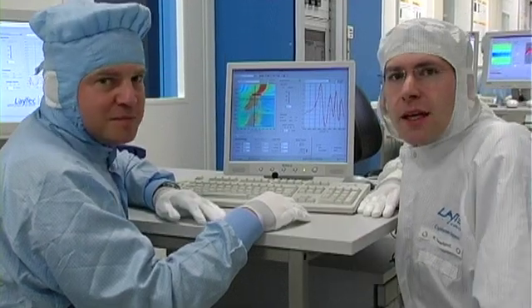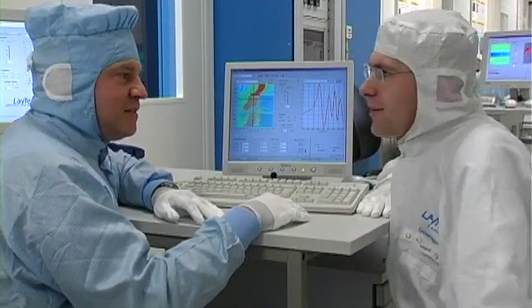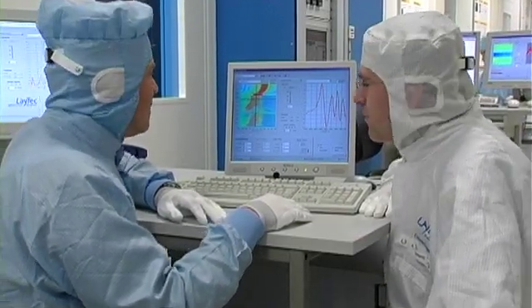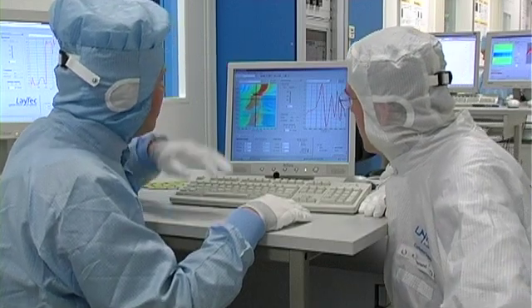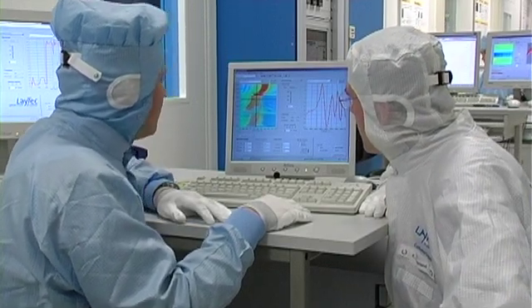This is Dr. Martin Solm. He's using the EPI-RAS. Martin, can you explain to us what we see here? Well, Kolja, what you see here is the fingerprint of the whole growth process of a laser structure.